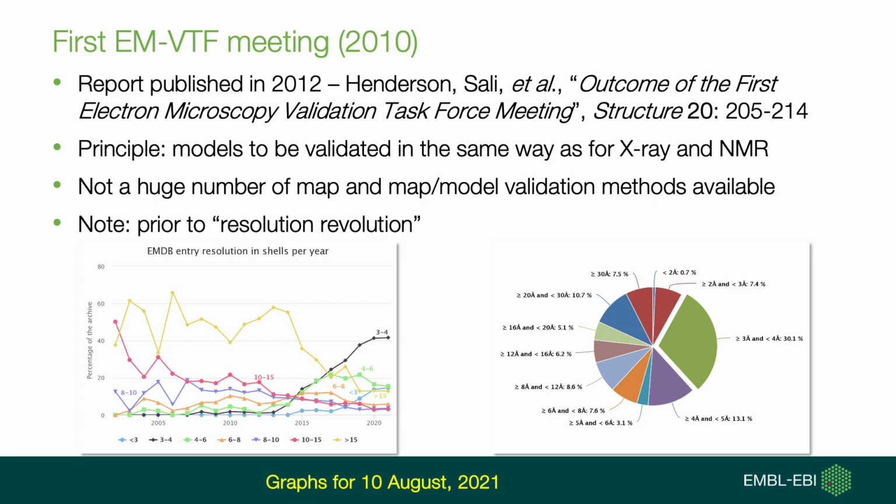From the EM point of view, there was a first validation meeting in 2010 at Rutgers, and the report appeared 2 years later in Structure. The principle was that models had to be validated in the same way as for X-ray and NMR, and at the time there was not a huge number of map and model validation methods available, and you have to realize that this was before the resolution revolution.